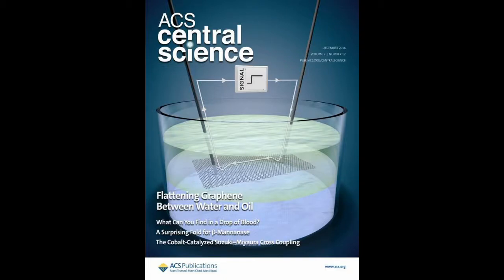The interfacial caging method is a method that allows for transferring large areas of graphene without using a polymer. The concept and details of the technique are described in the article shown on the screen. In addition to the articles, we also created this video as supporting material to highlight the workflow and a few nuances that we found crucial for the transfer efficiency and eventual graphene quality.